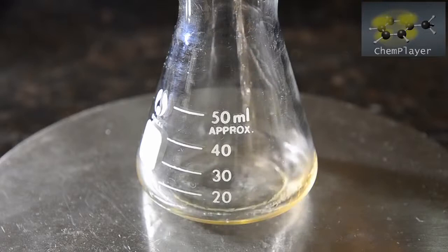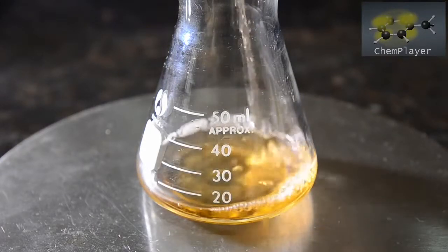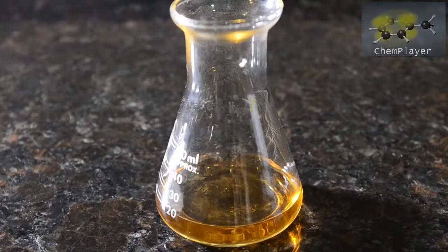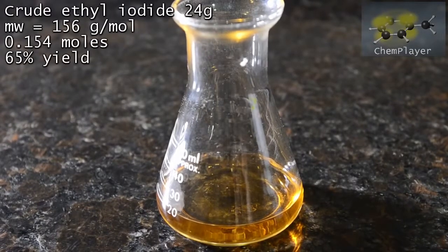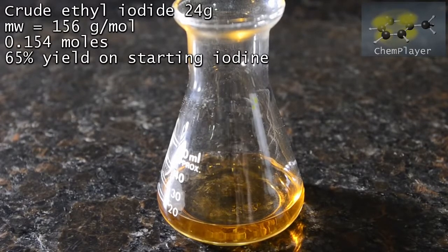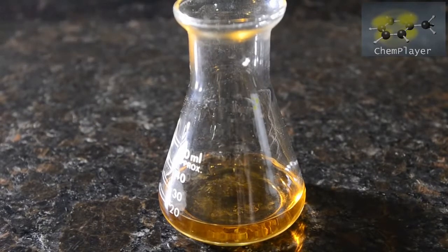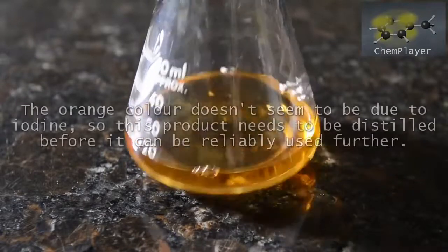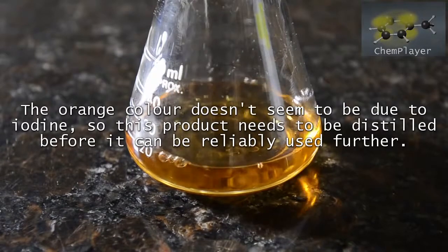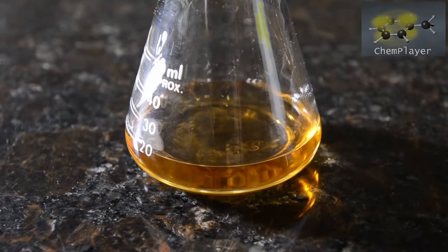We transferred this into another container for weighing. Here's the crude product: 24 grams of what seems to be fairly pure ethyl iodide, although it does have a yellow color and this doesn't seem to be due to iodine. This is a 65 percent yield from starting iodine. This is average, but the product is obviously not quite as pure as you obtain by using red phosphorus or from ethanol, potassium iodide, and phosphoric acid. But it was an interesting reaction and worth checking out.